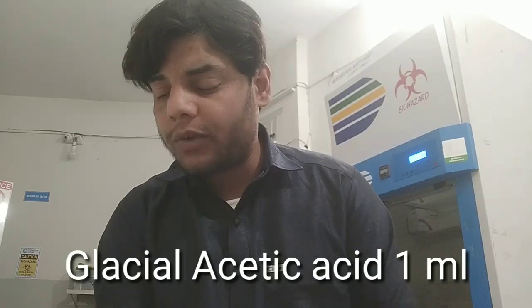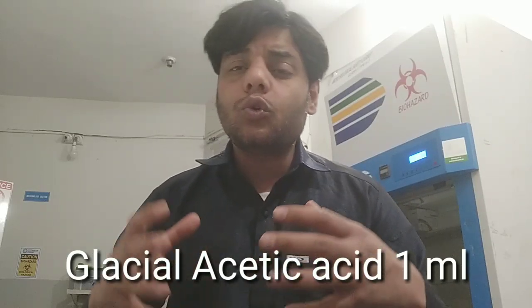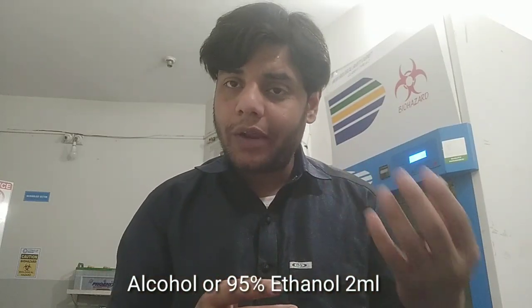ml, and 95% alcohol, we can also use 95% ethanol, that is 2 ml. So you will mix all these ingredients in distilled water, and then you will wait for 1 day. After 1 day you will filter it, so then you will get Albert staining solution A. Next we have Albert staining solution B.